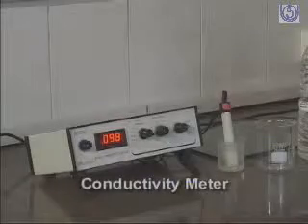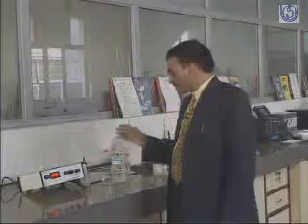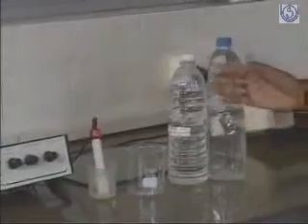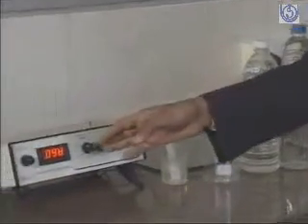This equipment is the conductivity meter, and the conductivity meter is required to estimate how much conductivity is there in a water sample. So we take the water sample into the flask, directly put the electrode into it, and conductivity can be read on this equipment.